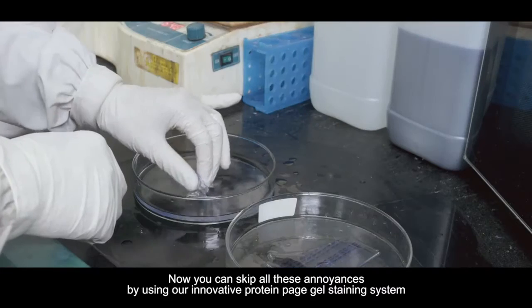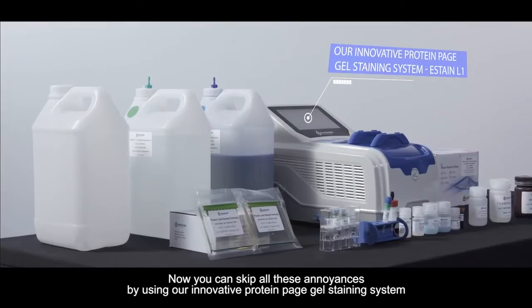Now you can skip all of these annoyances by using our innovative protein page gel staining system.